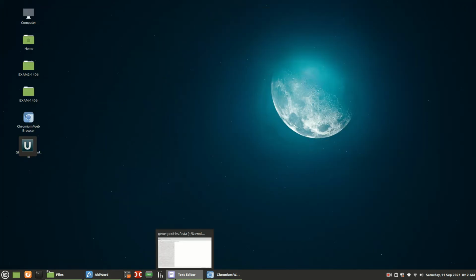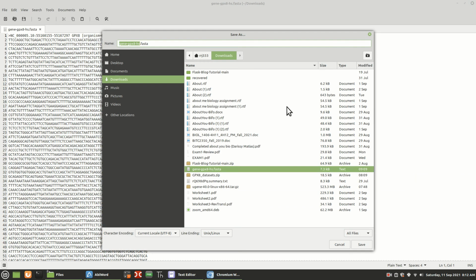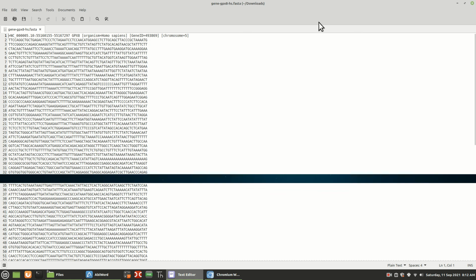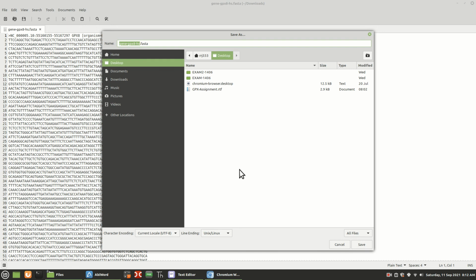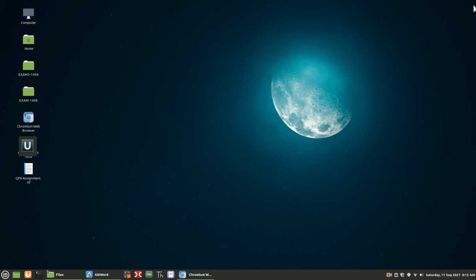And let's see, where did I save this? I saved this, it's just in downloads. I'm going to cut that and paste. Oops, nope. I'm going to save a copy of it to documents or something. For now, I'll just save it to desktop. Alright, so I have my gene. It is somewhere under here, right there, gene GPX8 Homo sapien FASTA.